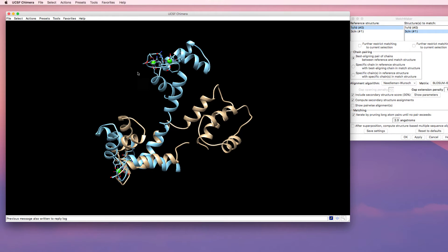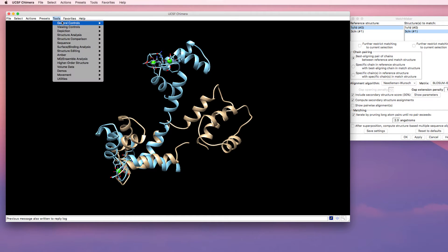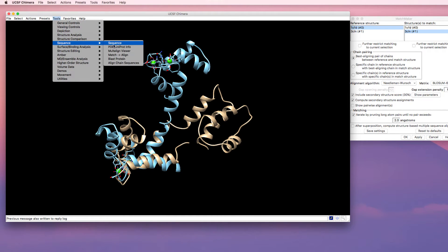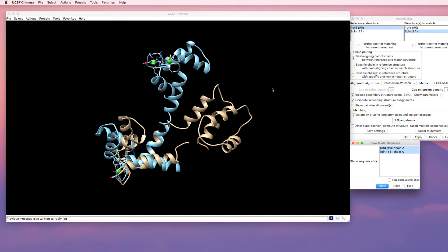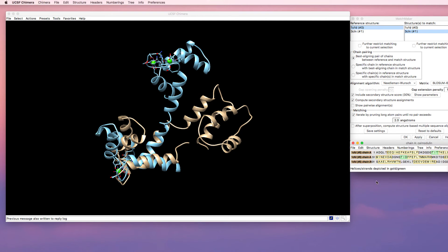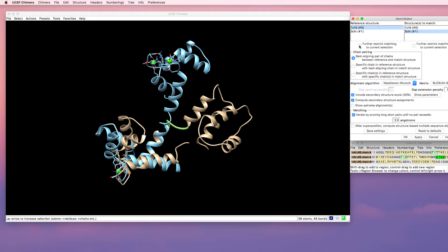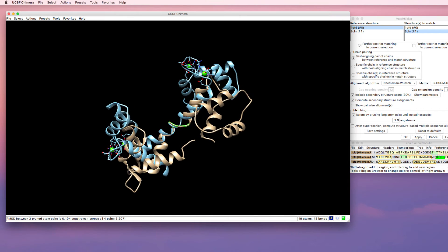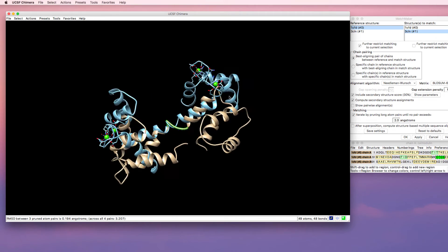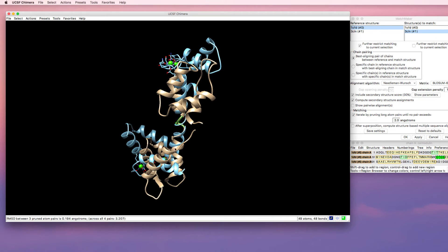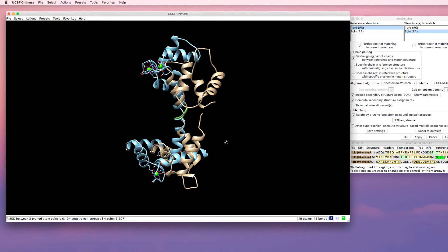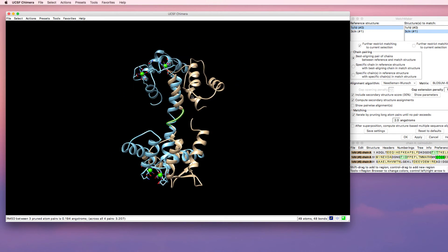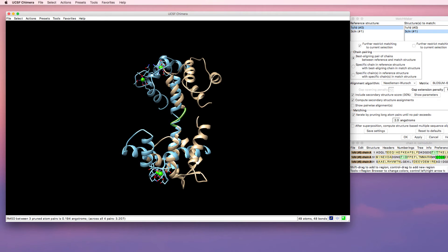So I'm going to select part of the protein in the middle. I'm going to do this by going to sequence and viewing the sequence for the APO form. Then I'm going to highlight a particular part of this protein. This time I'm going to tell the matchmaker to restrict the section to the currently selected section and apply that. Now you see I have a better match for the middle part of the protein and the two ends are kind of equal in their differences.